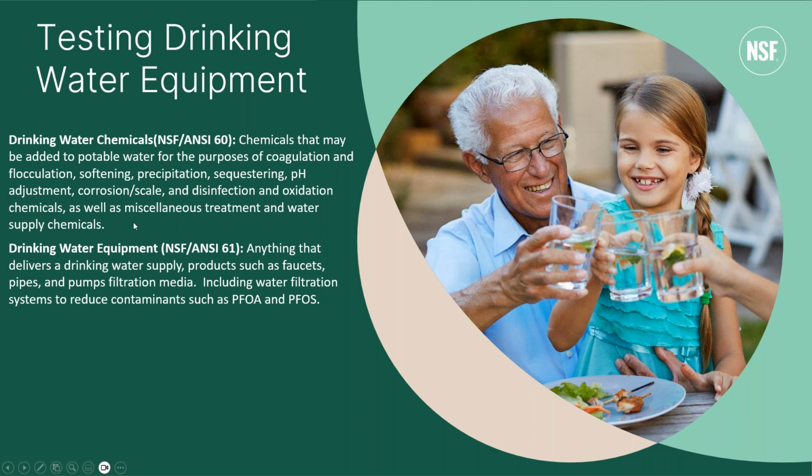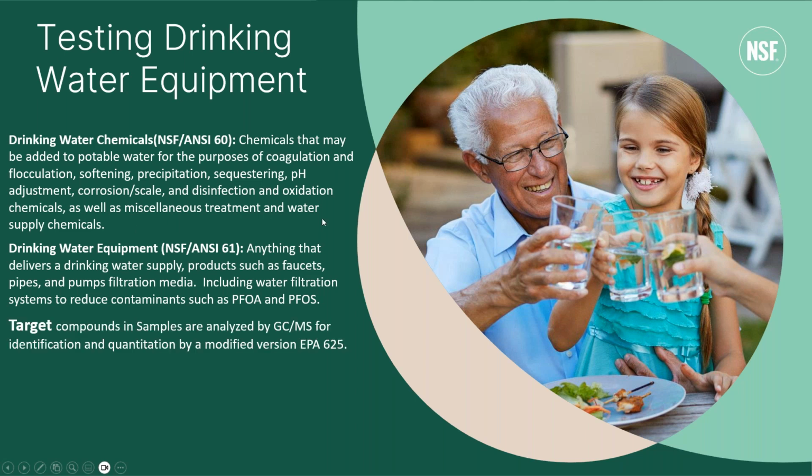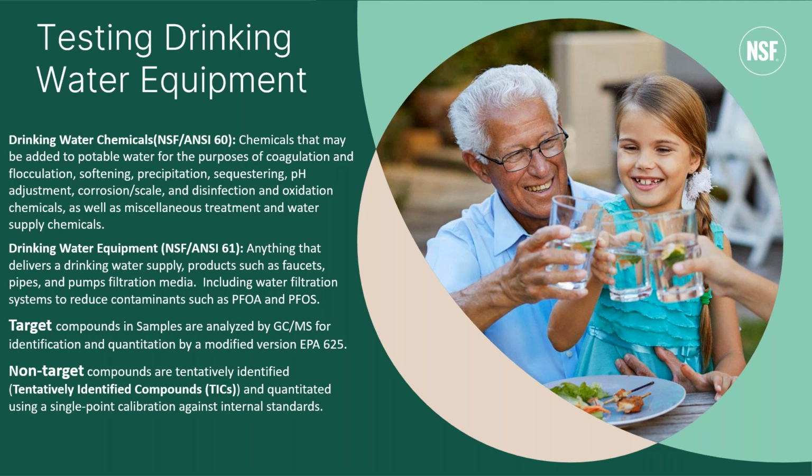And we'll test products to both of these standards to ensure that they're safe for consumer use. And to do that, we test first for target compounds, which would be any compounds that we might expect to be present in the sample based on its formulation or its specifications. But we also test every product for non-target compounds, which would be anything else we might find in the sample. And these we'll try to identify, and if we can, try and provide a rough approximation of concentration of them.